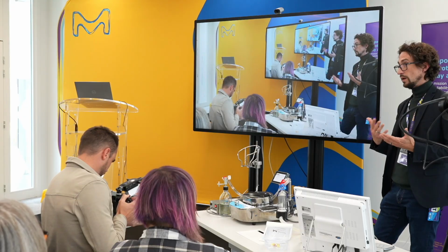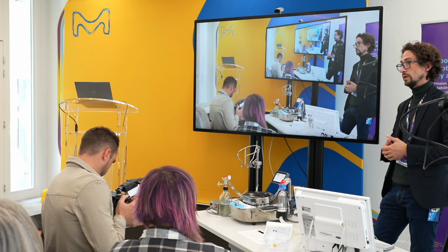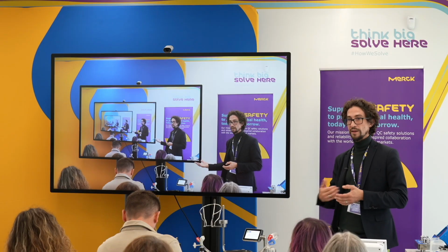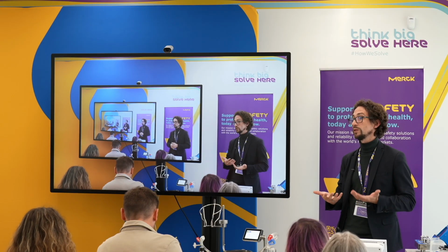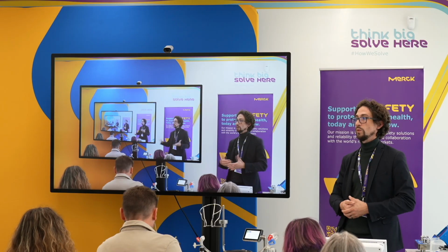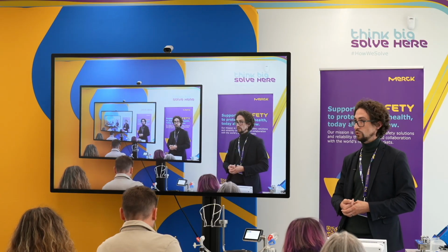We have seen that interviews with operators are difficult 14 days after the execution of the test. So that is really a support for the operator as well to help justify what has been performed during the test execution.